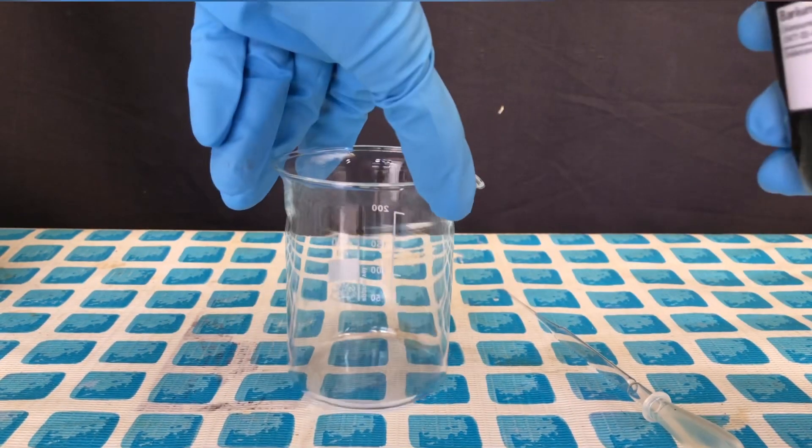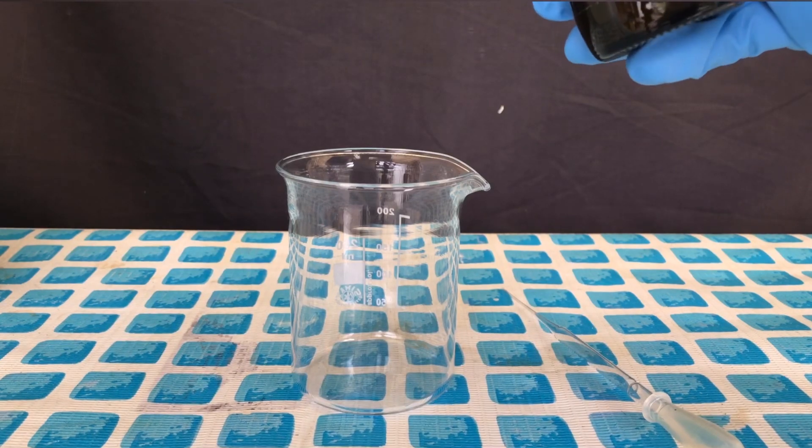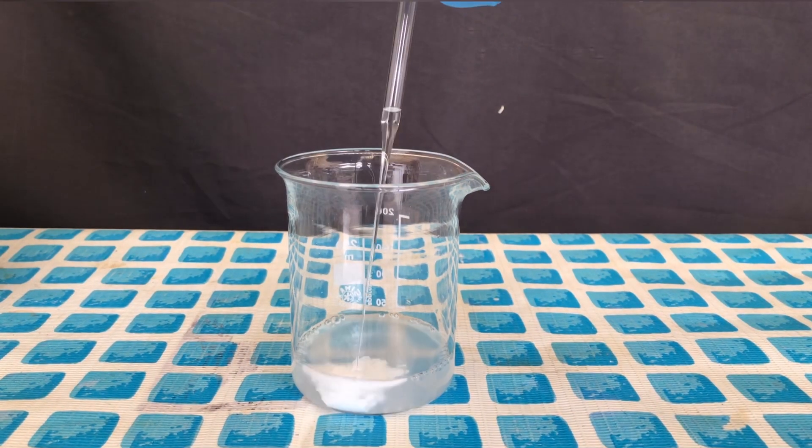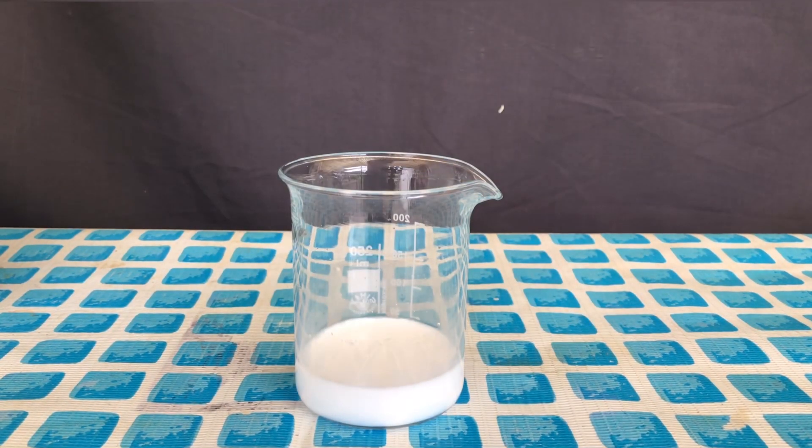For this you will need 25% barium chlorate solution and sulfuric acid. We used 14.9% sulfuric acid. We started off by adding the barium chlorate solution to a beaker. Afterwards, sulfuric acid was added dropwise.